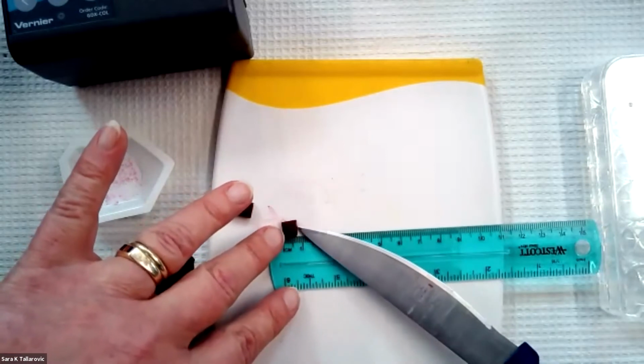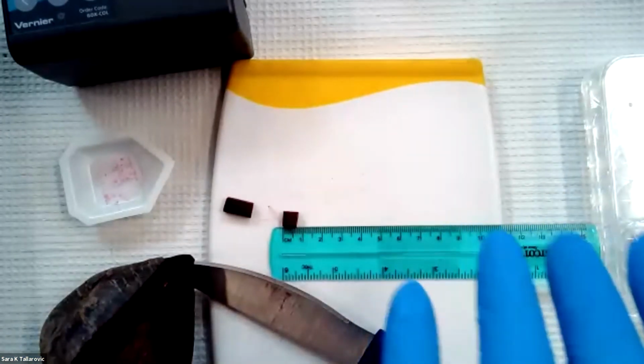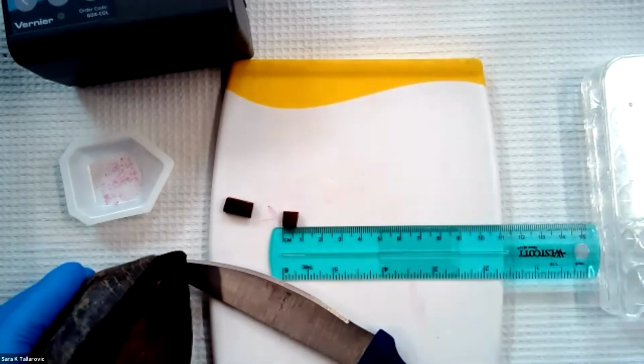Before you start, and I'm also going to, I just realized I should be putting on my PPE. This lab doesn't use particularly harmful chemicals, but you certainly don't want students splashing anything in their eye. The other thing to consider is that beet juice does stain. So we recommend with this lab that students use aprons and that they wear eye protection. So I'm going to put my eye protection on before I start handling any liquid samples.